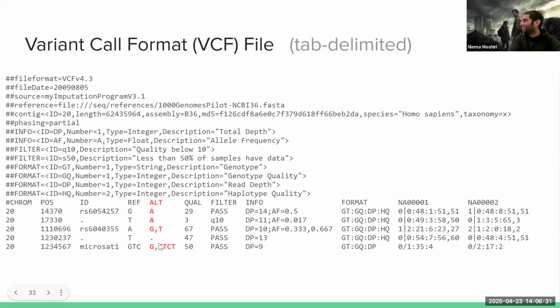But yeah, so weird stuff can happen. That's kind of how you interpret those. I mentioned last time that there's quality scores associated with each of these variants. So in the same way that when we run a sequencing experiment, I mentioned the FASTQ file, you have quality scores associated with each letter, which says this is how confident the sequencer is that this letter actually is that letter.